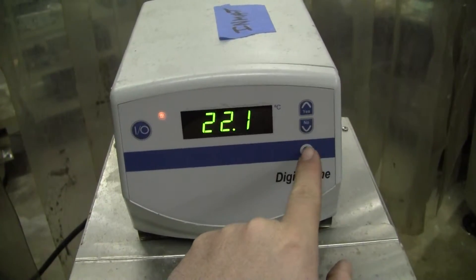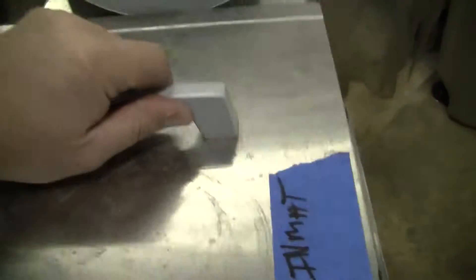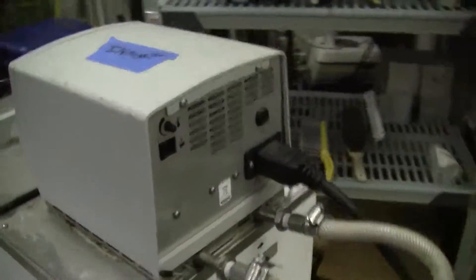This bath once again goes up to 200 degrees C. Large volume for liquids. It runs on a 20 amp circuit.